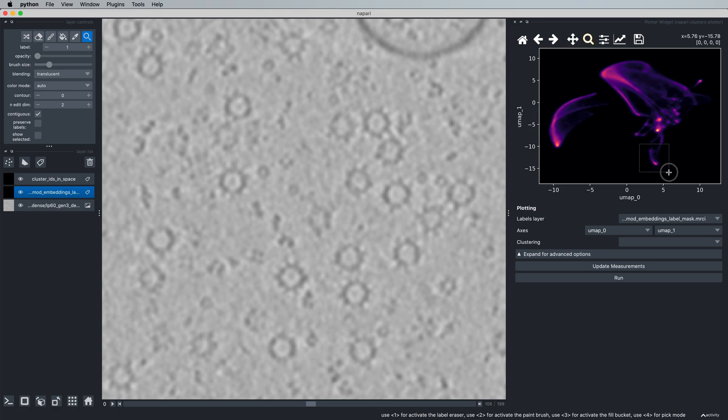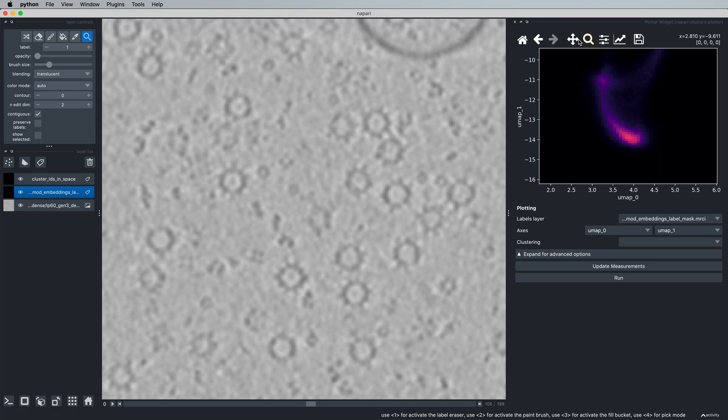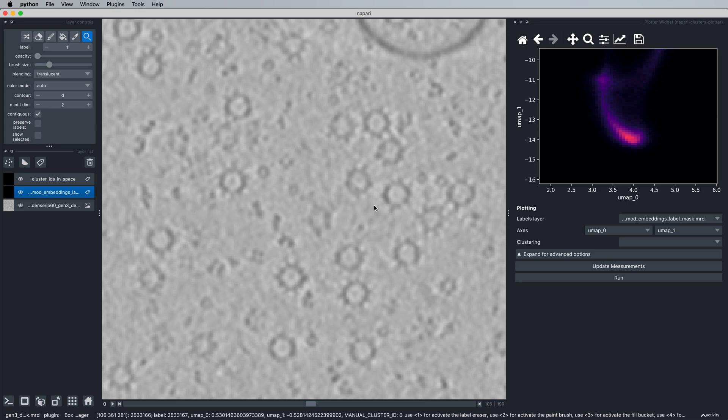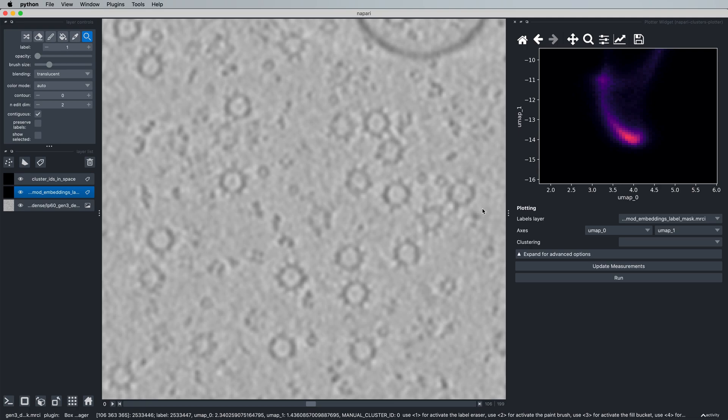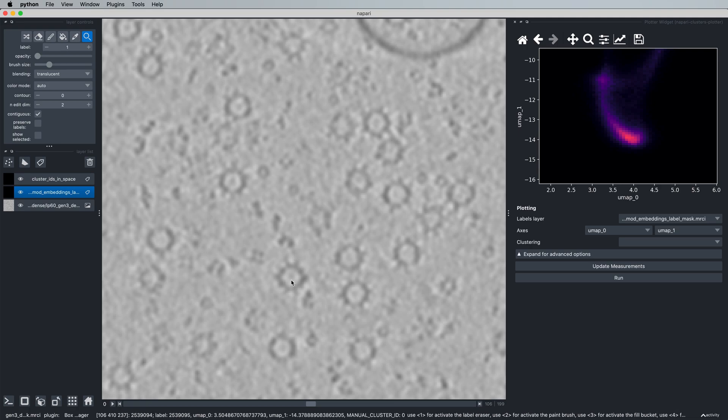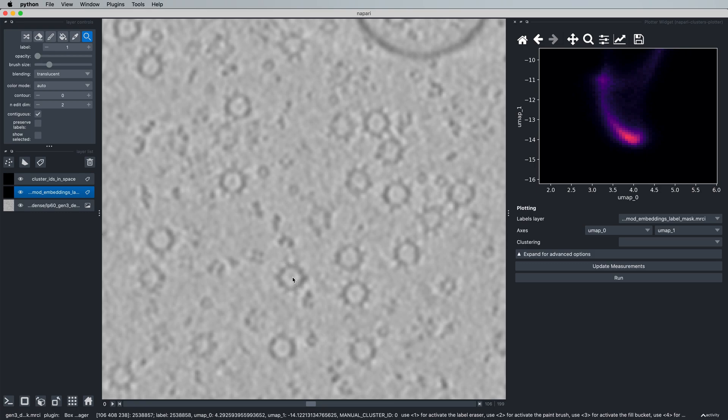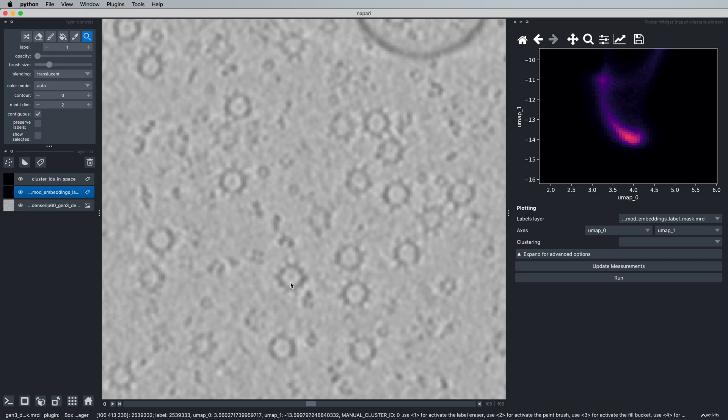This cluster elongation happens with the nature of the way that TomoTwin creates embeddings from the tomogram. It essentially moves a sliding window through the tomogram and generates embeddings as it goes. So when you have a particularly large protein of interest, you're going to have embeddings where the protein is in the box, but not necessarily centered within the box. And you're always going to have at least one embedding where the protein is centered within the box.